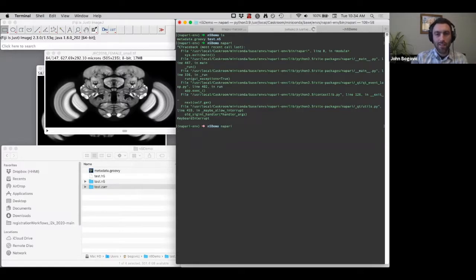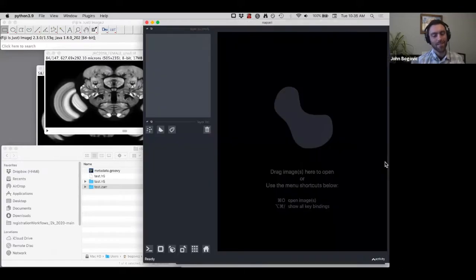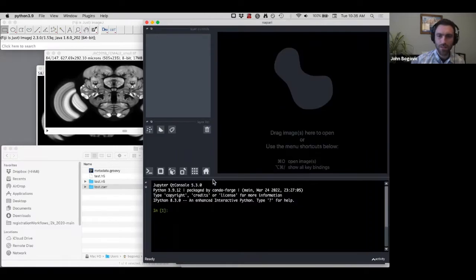You know, in the Python world, there's Napari, and Napari and Python support Zarr quite well, and they don't support N5 so well. And what I mean by that is, the Zarr library can read and write N5s, but Zarr mostly focuses on Zarr. So I think what I'll show now is I'll show an image in Napari, and then I will write it with Zarr, and then I'll just read it with Fiji.